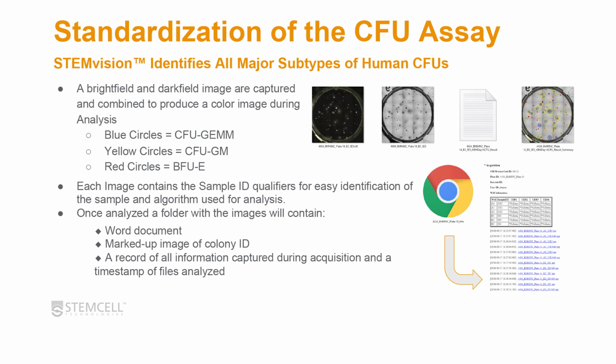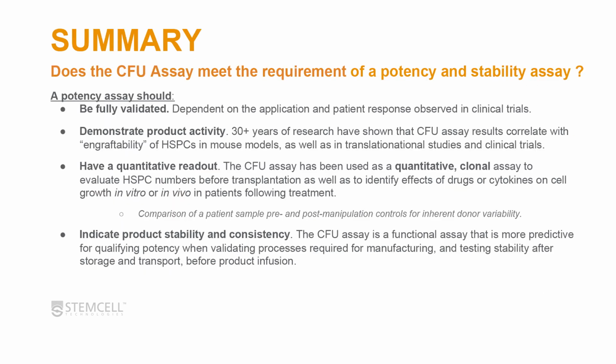If you click on the image, it tells you, once you've analyzed your images, a readout of what unit you used, what your plate ID was, what your barcode ID was if you use barcodes, and what your user ID was, as well as all the identifiers that you can put in. These are captured here and timestamped so that you know these images were taken 14 days after the cultures were initiated, so you're well within your QC parameters for setup and analysis.